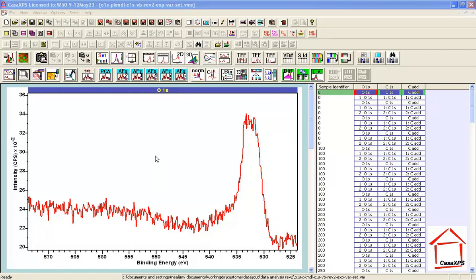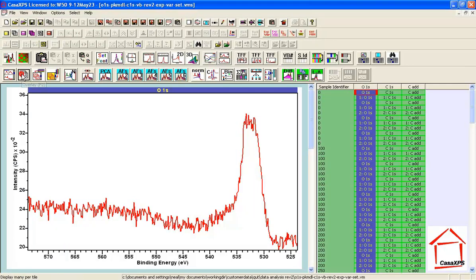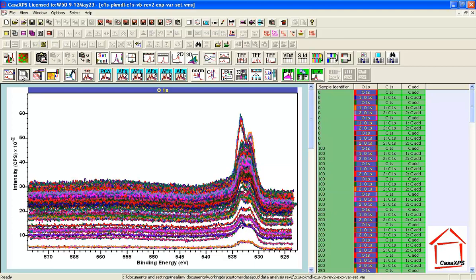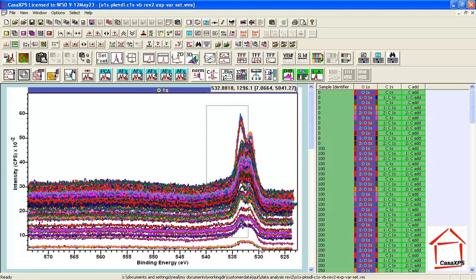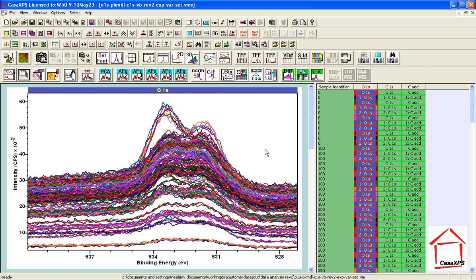The next step is to use the data itself to point to the number of different spectral shapes important to this data set. The full data set corresponds to a series of measurements — different points on the sample, multiple measurements at the same point, different temperatures — producing a range of shapes. Any peak model representing the chemistry we believe is present — even as temperature changes — should apply to all spectra with the same position and FWHM, so we can explain what happens to this surface as soot changes with temperature.